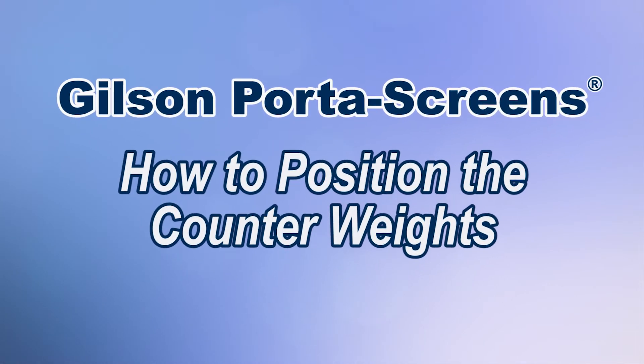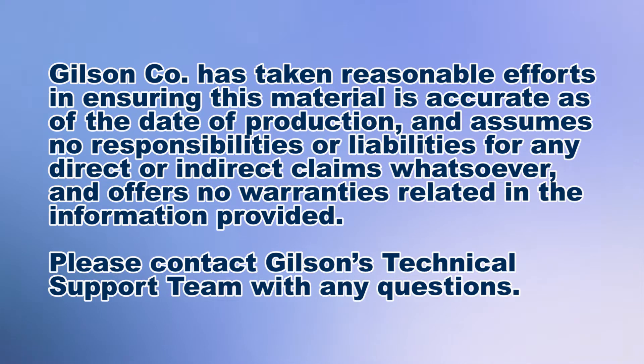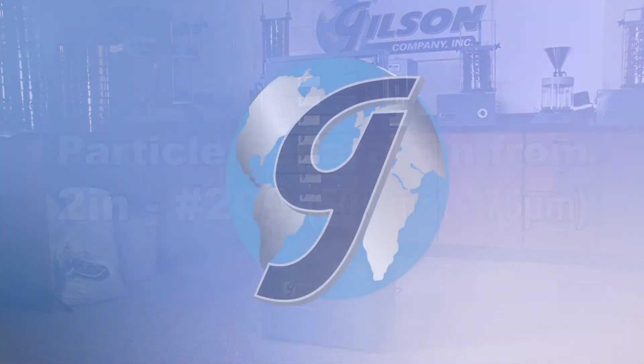The Gilson PortaScreens are rugged, lightweight, portable screen shakers that are designed for efficient particle separation of materials in the 2 inch to number 16 range, but can effectively process materials to number 200.